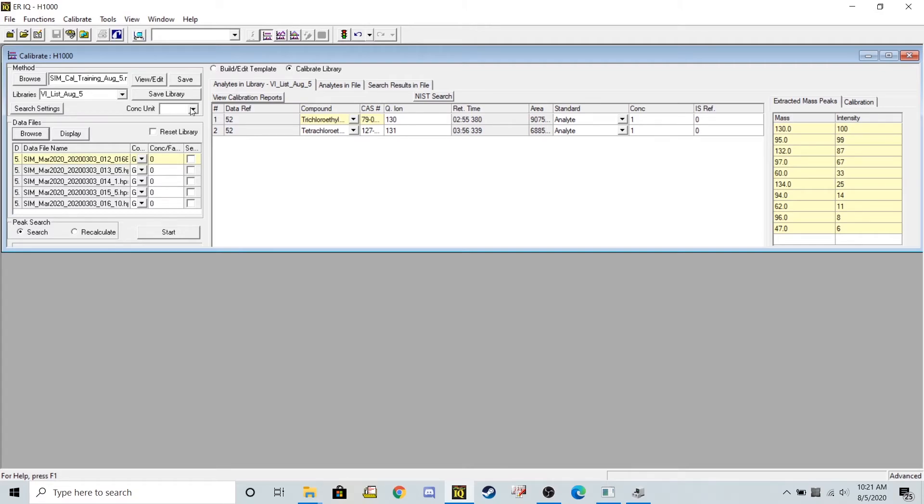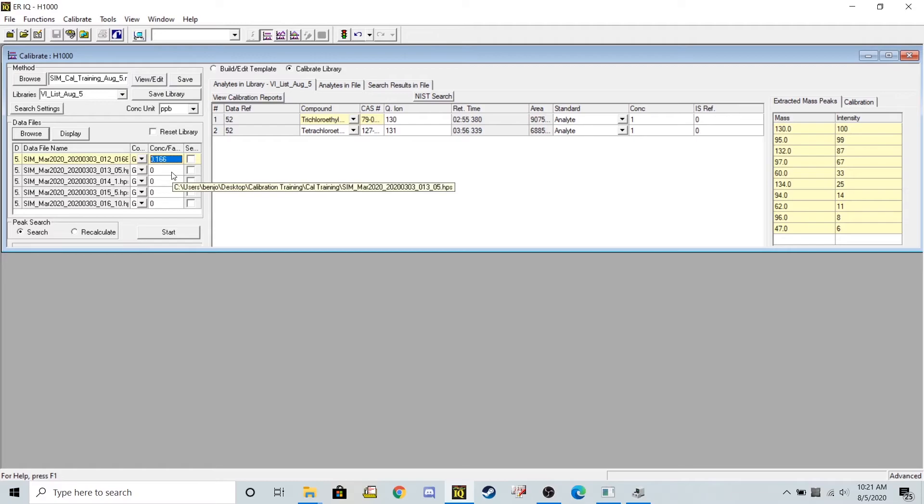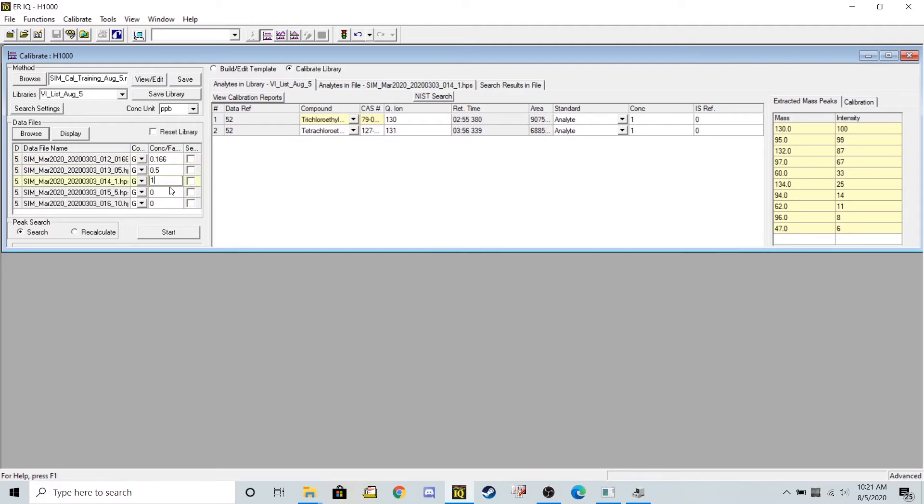Now I'm going to put in my units. So my units here are going to be parts per billion. And my concentration factors, 0.166, 0.5, 1, 5, and 10.